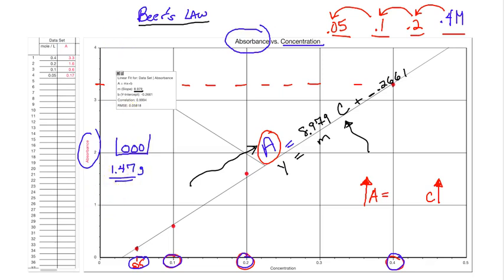And then we figured out how much nitric acid was needed to dissolve it. I poured nitric acid into this, which looks like blood, and of course, you saw that reddish brown gas leaving. That's the NO2.